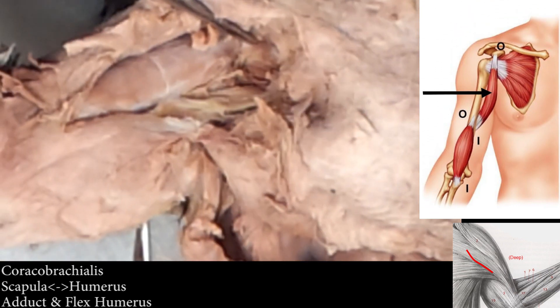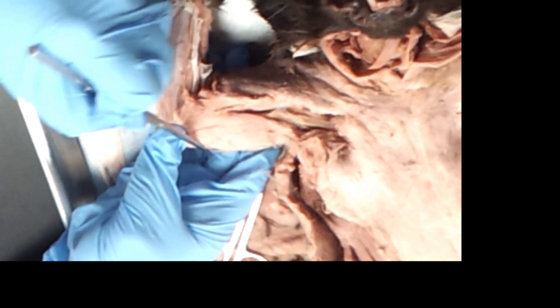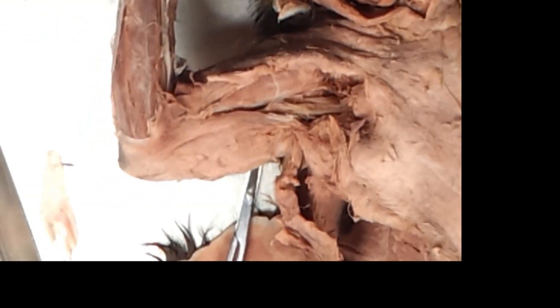You couldn't do that little armpit motion without the coracobrachialis. So: epitrochlearis, biceps brachii, brachialis, and then coracobrachialis where the probe is. It's easy — everybody got done early last hour. The hard part is getting through that fascia. So have fun with that.